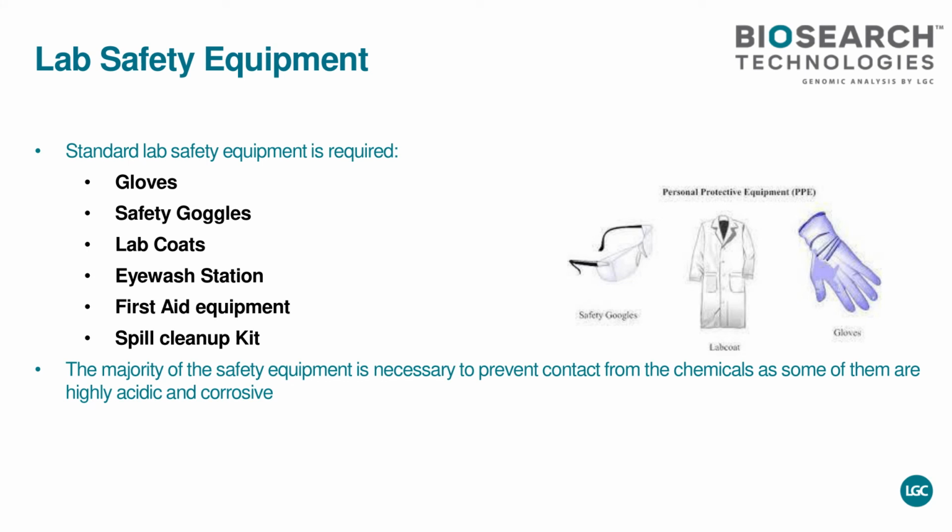I like to speak about the safety, and again, the safety, because we are working with chemical reagents, so we have to be careful. This is acidic, this is basic, so of course you have to use gloves, safety goggles, a lab coat. This looks normal, but some people who never did chemistry or worked in laboratories, they forget it. So it's very important to keep that in mind.